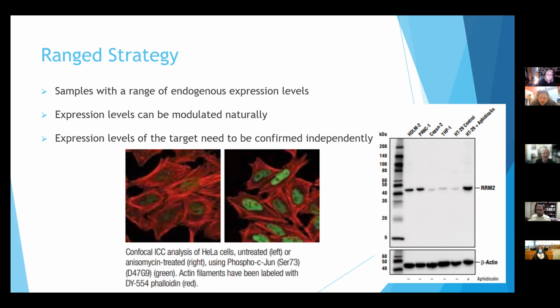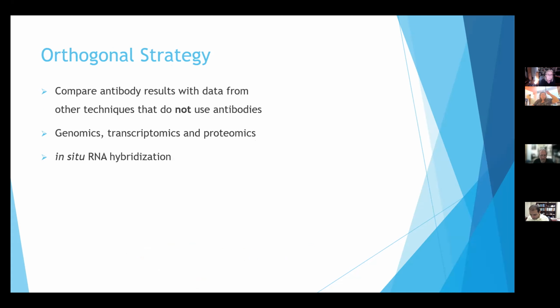And this one, yeah, this one isn't good. This one is worse because this one doesn't show ranges. I guess it does to some degree because you would normalize for the amount of actin. But in the interest of time, I'm not going to worry about that.